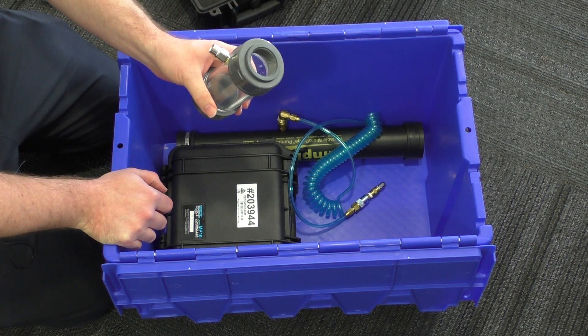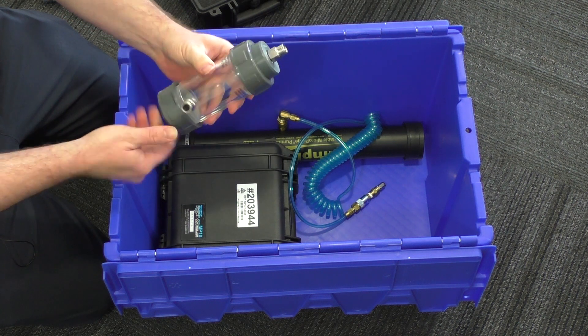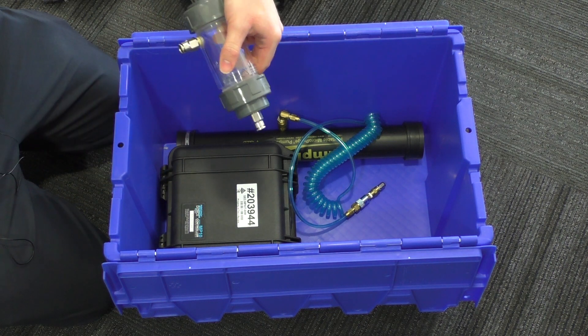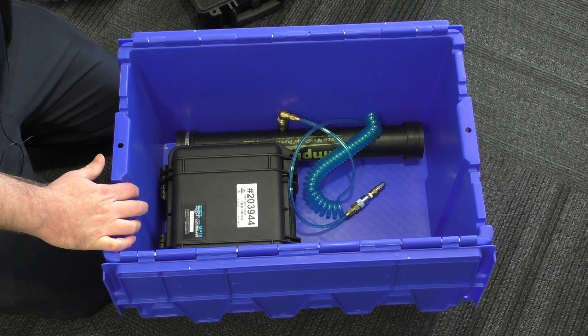We have a flow cell which matches with our HANA water quality meters. Push fit fitting so the tubes inlet through the bottom and out through here to whatever your sample's going into — your slops bucket as it were.